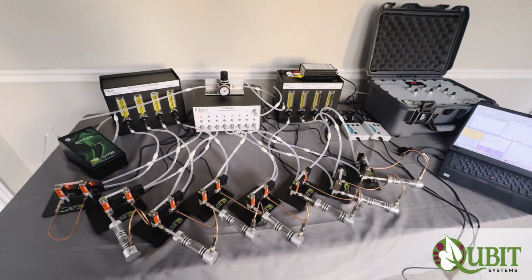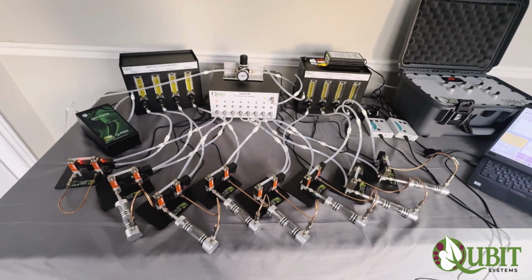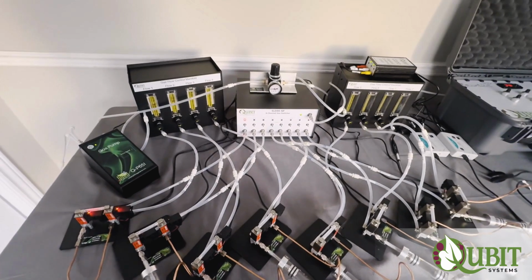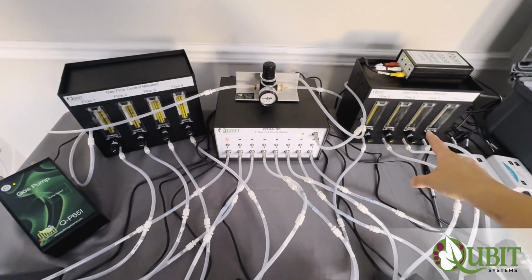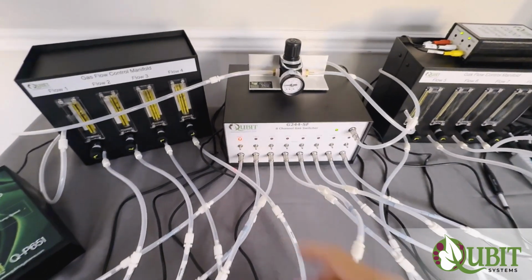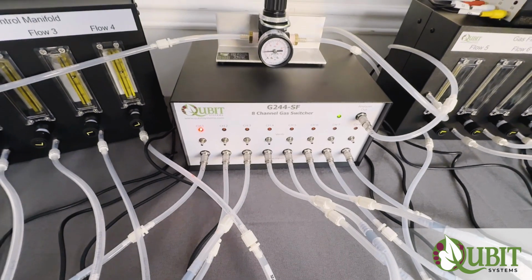This video shows a stop flow setup for 8-channel system. So in the case of an 8-channel system, we have 2 flow manifolds, so total of 8 flow meters. Of course, we've got an 8-channel gas switching system, the G244, which is set up for stop flow.